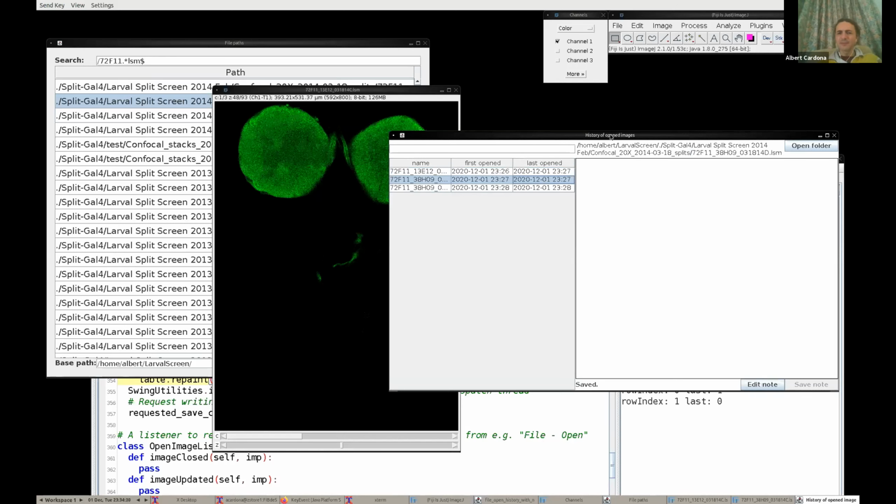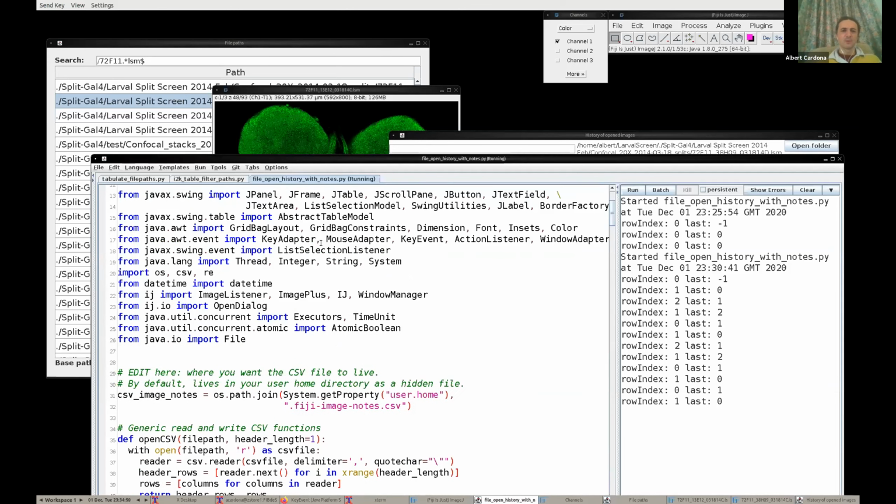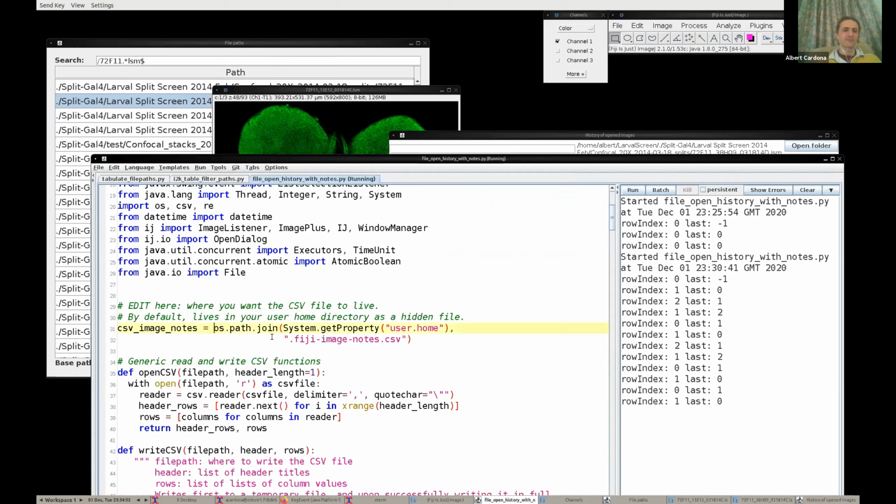This seems like a very simple thing, but actually it removes headaches to a point that you wouldn't believe, because suddenly you have everything in a structured way, in, say, one single CSV file for each one of your data sets. Because remember, in the script, at the very beginning, you can either ask it to open a file, like we did for the tabulate file paths, or here directly, simply you type which file path you want. For this data set, for that data set, etc. You can even have them commented out, and then you comment in the one data set that you want to use at the moment when you run this script.